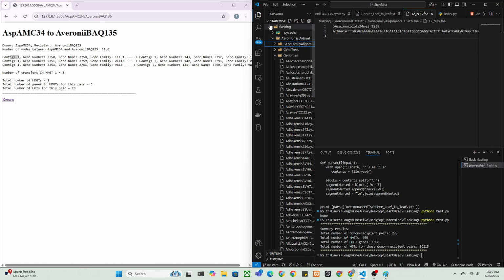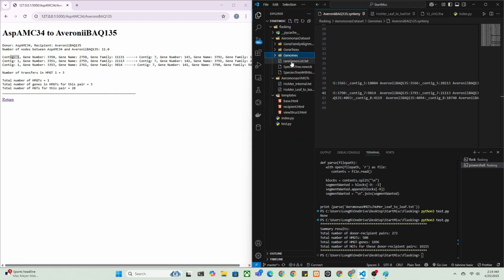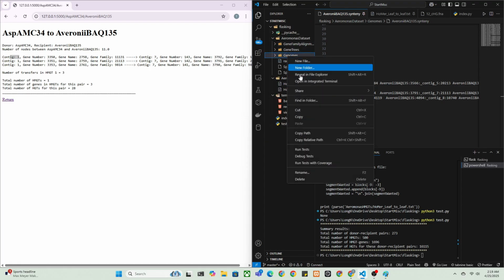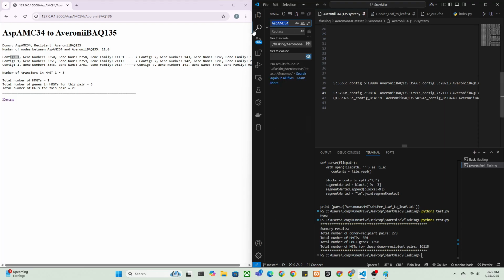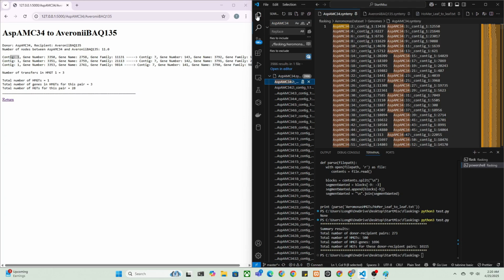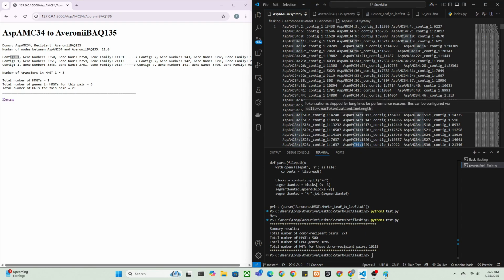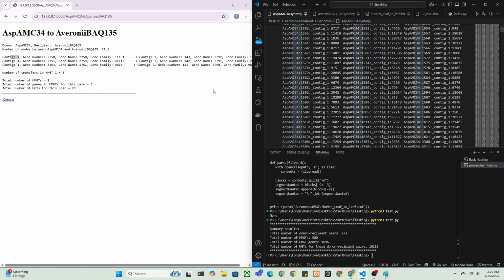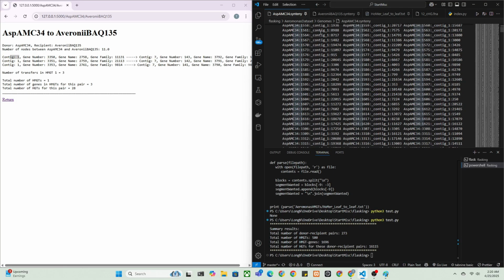So manually doing this, we would copy and paste the donor and manually look at all this stuff, which is not ideal, which is why I'm building this tool in the first place, so we can make this more readable and faster.